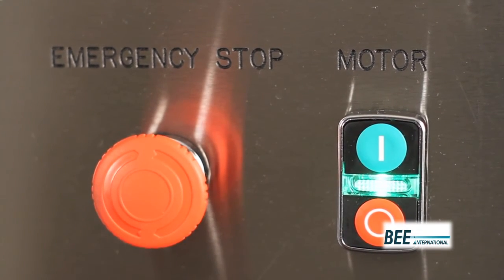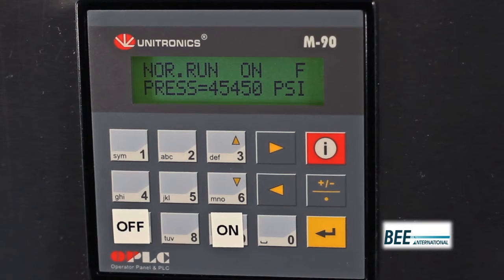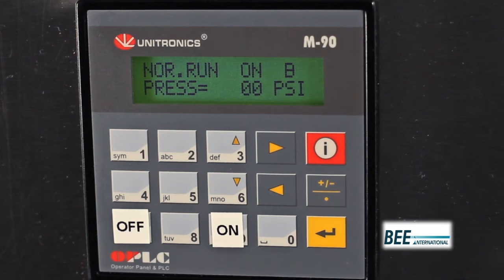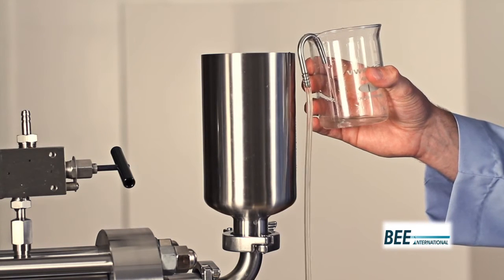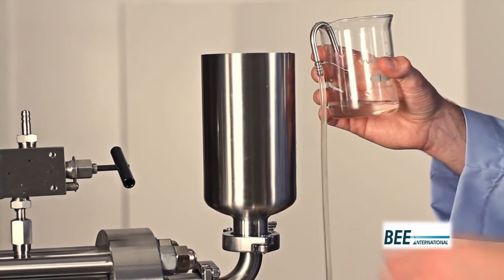Turn on the intensifier pump by pressing the on button on the PLC display. Process pressure is displayed on the PLC. Turn the pressure set dial to adjust the process pressure anywhere up to 3,100 bar or 45,000 psi. Your product is now being processed.